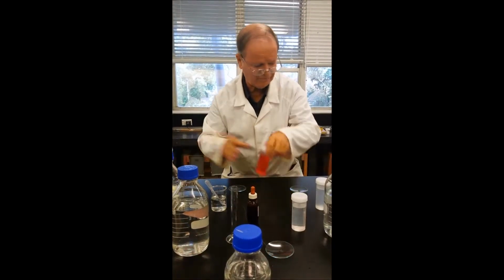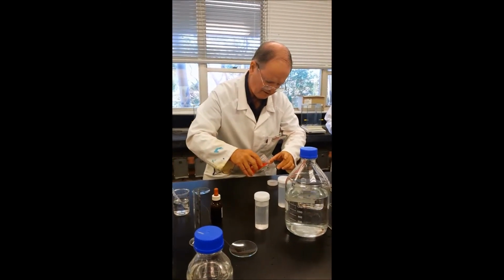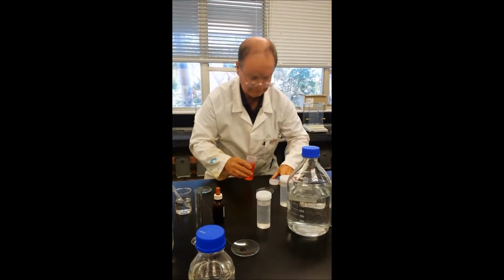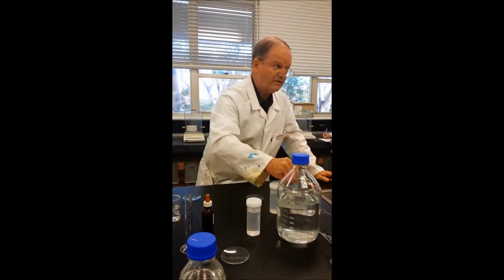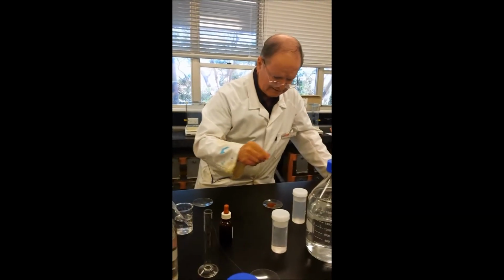Okay, first one's the methyl orange. Now, I don't want to be doing a whole lot of checks, and I don't want to be washing a whole lot of glassware. You've got me with the methyl orange. You can have that. Right. Don't drink it. You can have it as yours. You've got to finish the labelling.